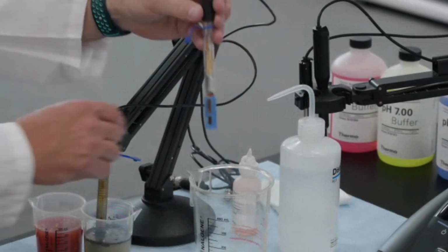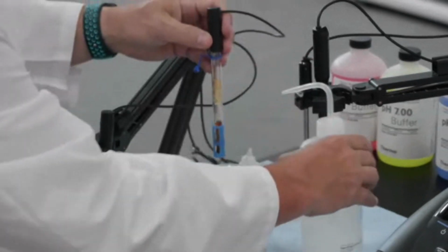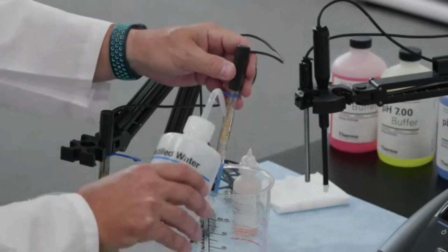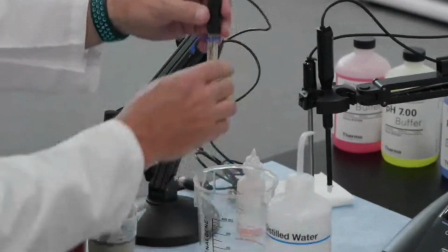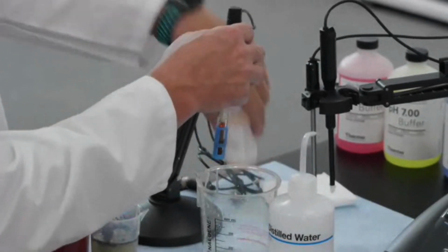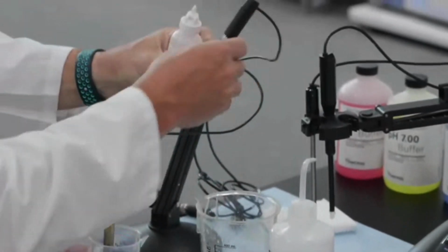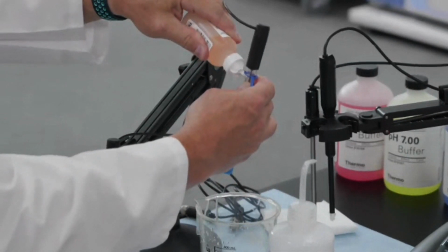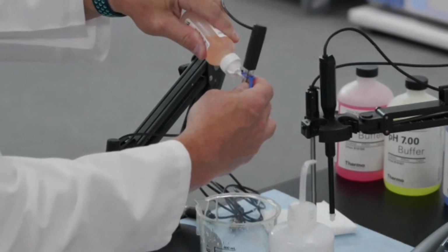It's as simple as that. And then to measure, we'll rinse the electrode off and refill it for our next sample measurement.